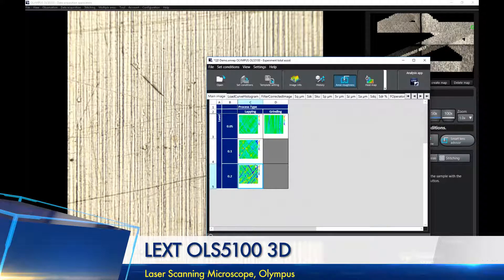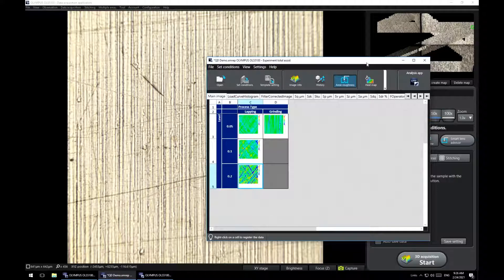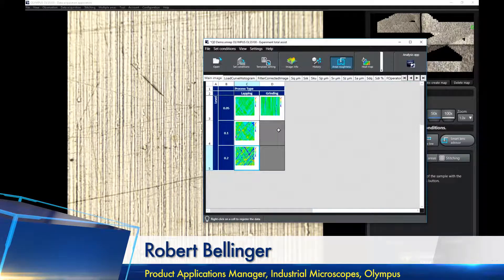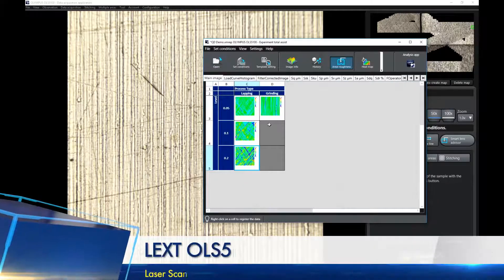Say you're creating an experiment with four different types of samples and different coatings, tracking a measurement of width or step height on each sample over time — you'd have to manually calculate everything afterwards. Now with this tool, I've set up a simple experiment with two process types — lapping and grinding — at different polishing levels. I've already done four different locations, and continuing is as simple as clicking into the information you still have left to do.